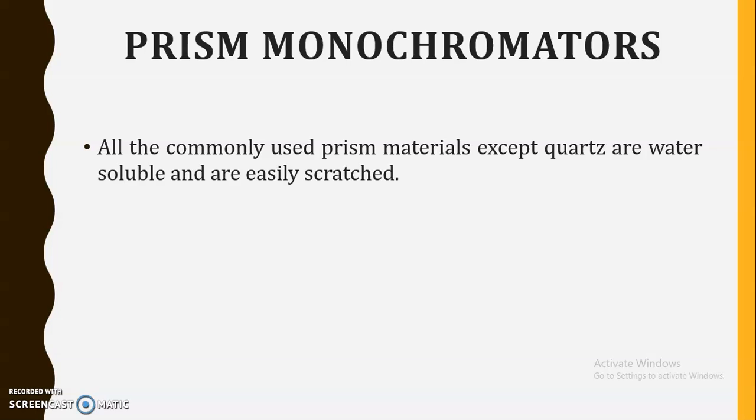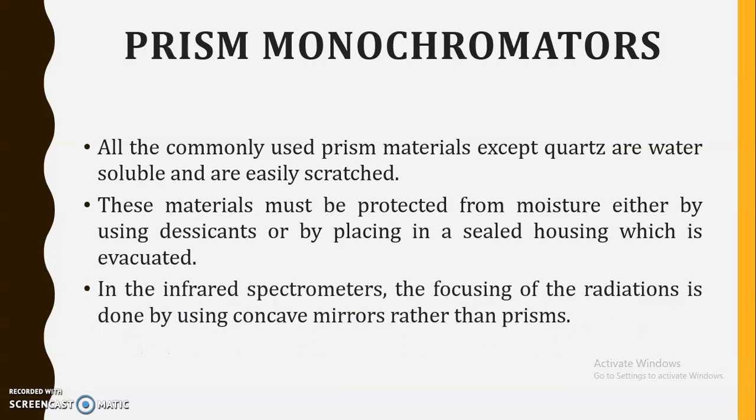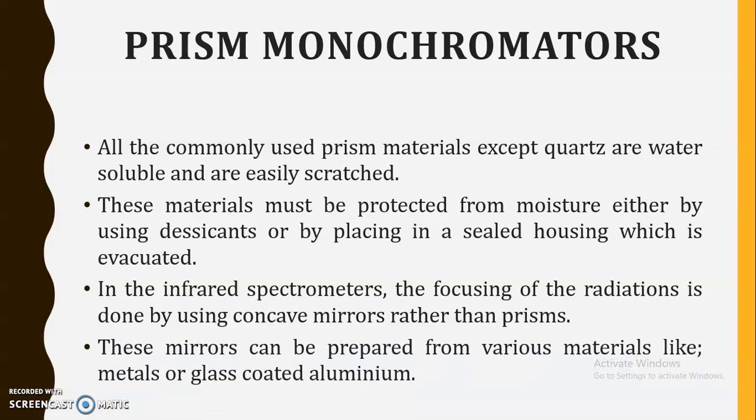All the commonly used prism materials except quartz are water soluble and they are easily scratched. These materials must be protected from moisture, either by using desiccants or a desiccator, or by placing them in a sealed tube which is evacuated. In infrared spectrophotometers, the focusing of the radiation is done by using concave mirrors rather than prisms. These mirrors can be prepared from various materials like metals or glass coated with aluminum.